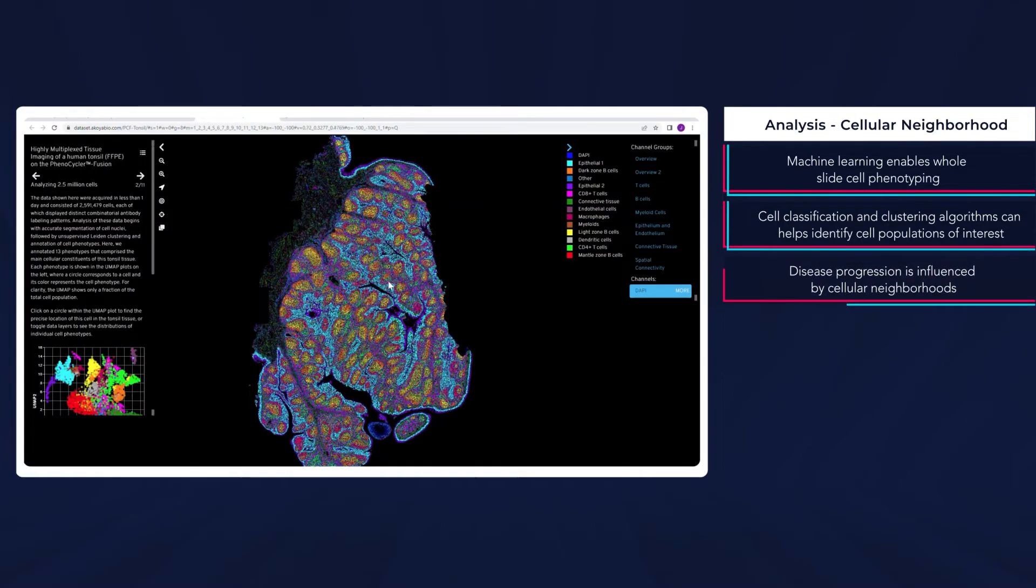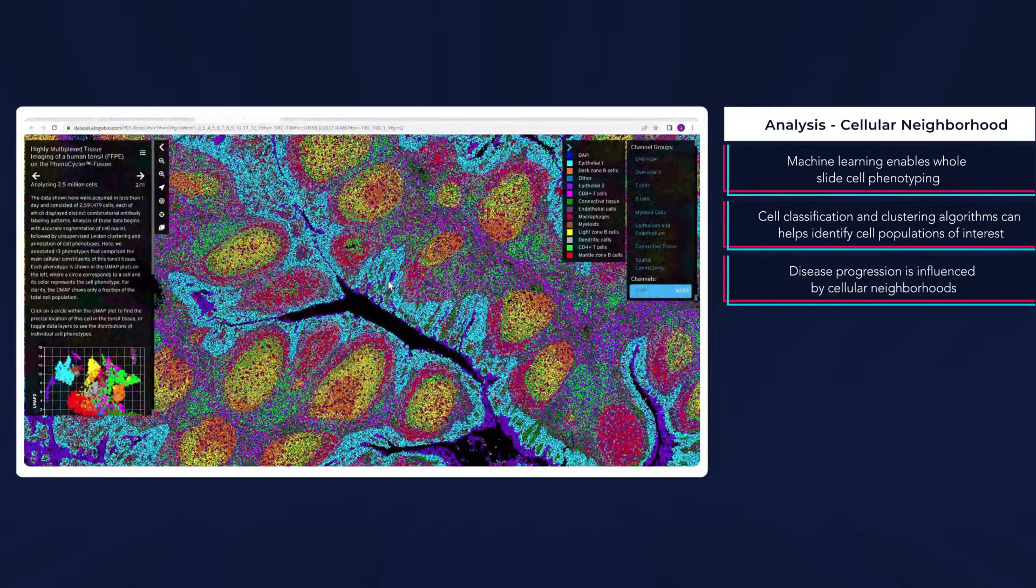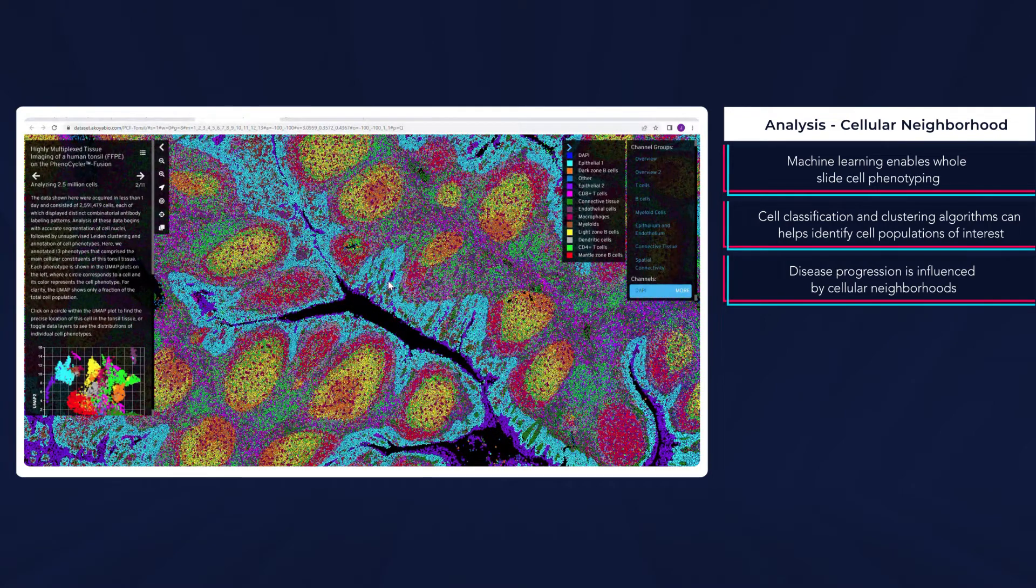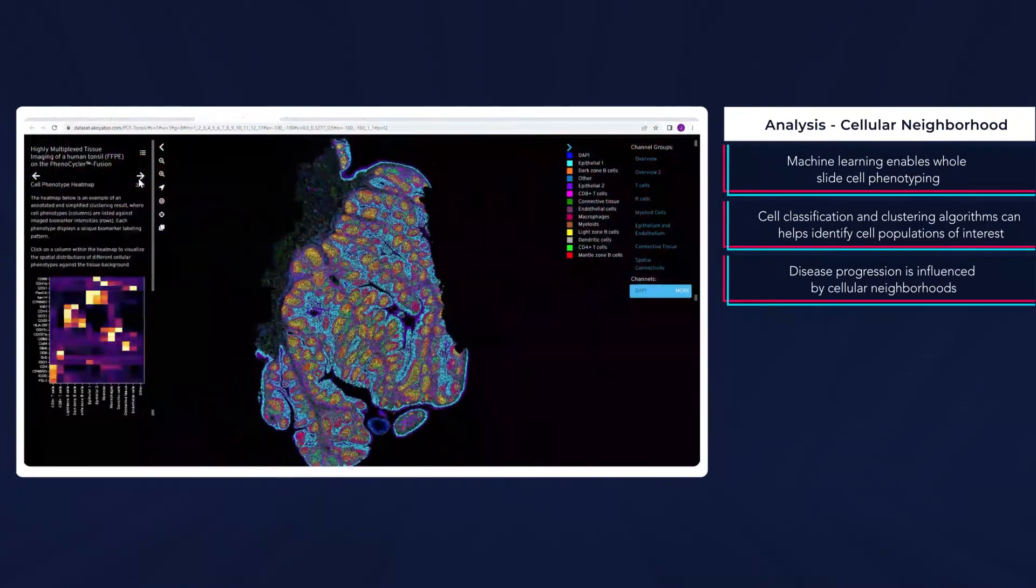As the story of cellular interactions take shape, we can explore the cellular neighborhood, cells that organize into distinct spatial patterns that may influence disease progression.